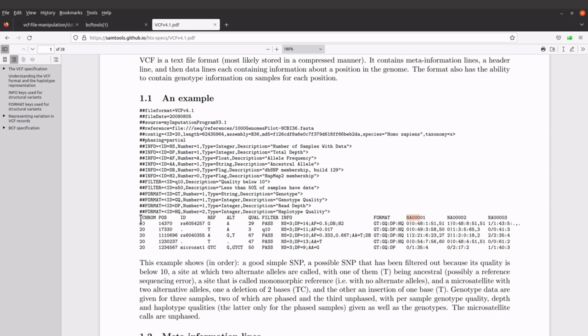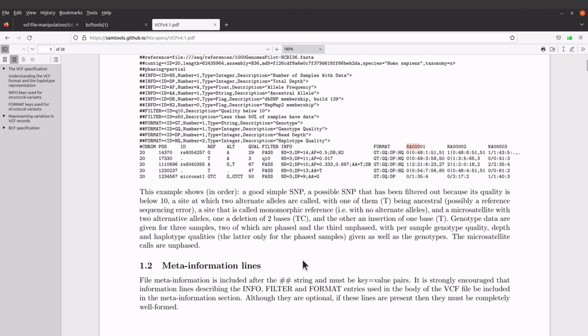We are just going to issue commands that will explore and then also extract the information that we have here. So just make sure you read this document and then have an idea of what a VCF file is, in case you don't know, or in case you are new into this particular kind of task. So let's go back to the terminal and then proceed.